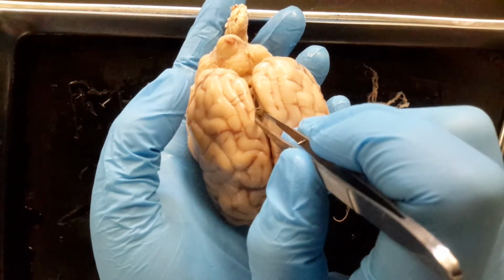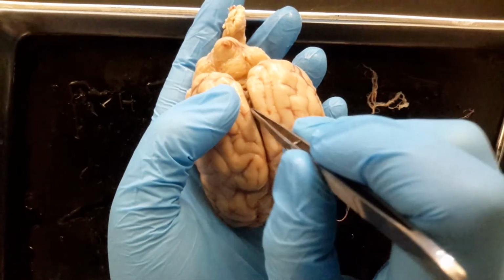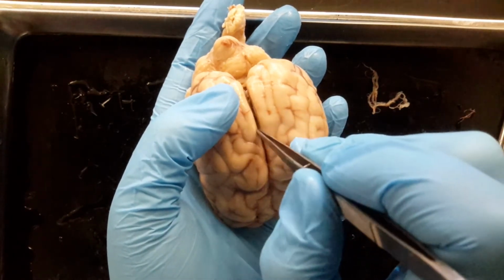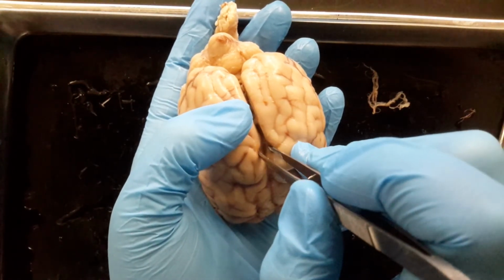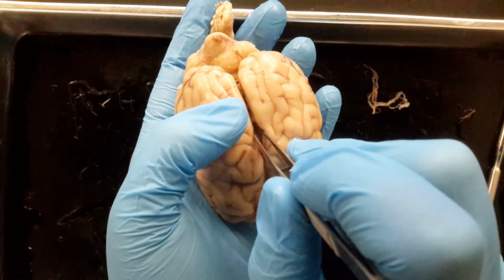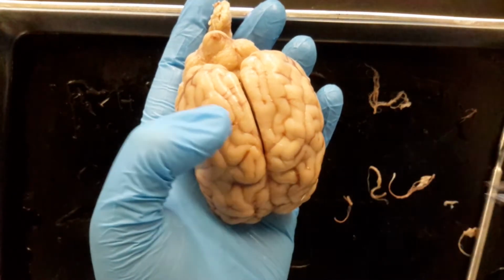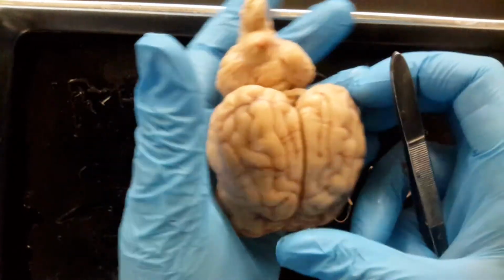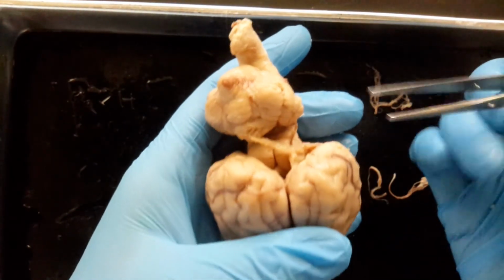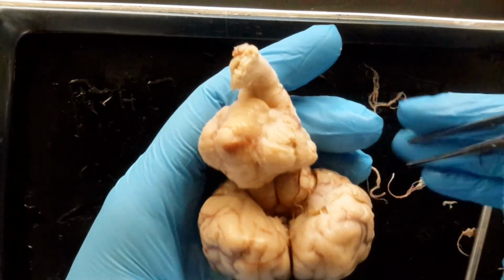Put it in, gently open it, and that will break the connective tissue, hopefully without causing too much damage, so that you can clearly define your longitudinal fissure. This is a way, ideally, to do it without causing too much damage. You're going to want to do that all the way to the back. Now this one's nice because some of the connective tissue has already been cleaned off.